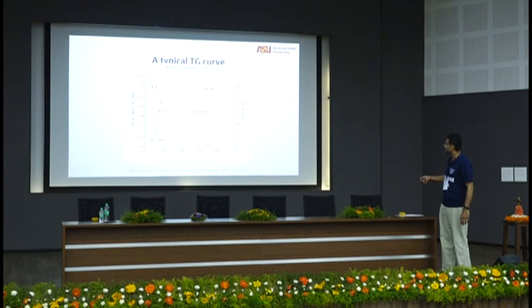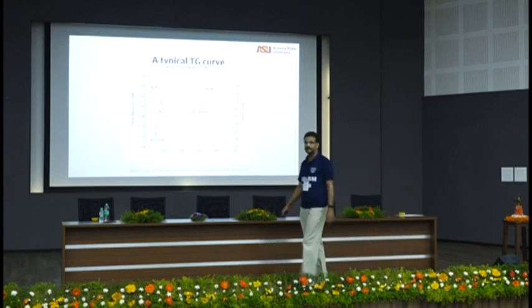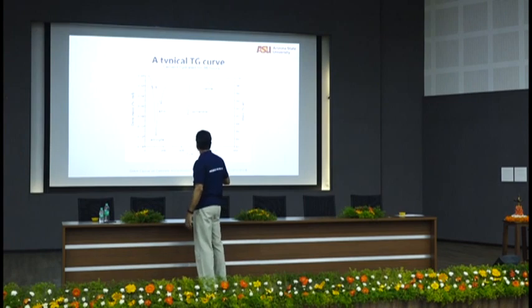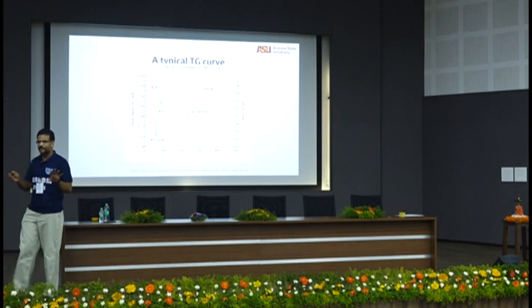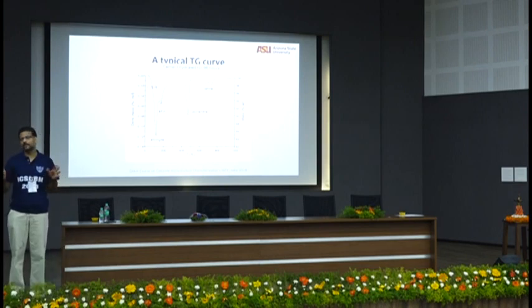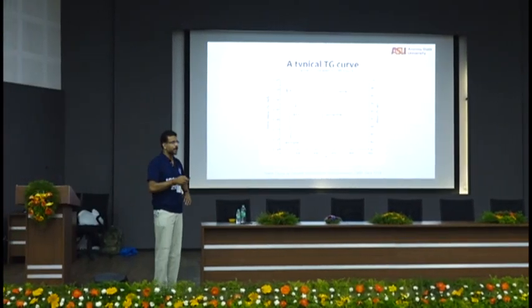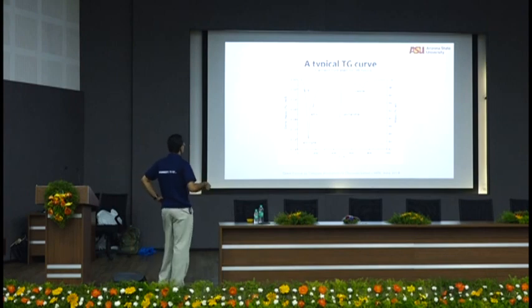So I can say here, at about 150 degrees Celsius, I see a peak, and I look at the literature and say 150 is typically ettringite. So that is the ettringite peak. For calcium hydroxide and CSH, there's a little confusion on how much CSH there is, and what the temperature of CSH decomposition is based on the C over S ratio and all those things. But you can still get a feel for what that value is.